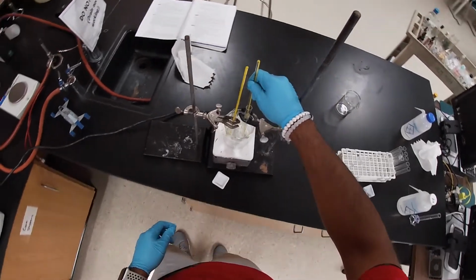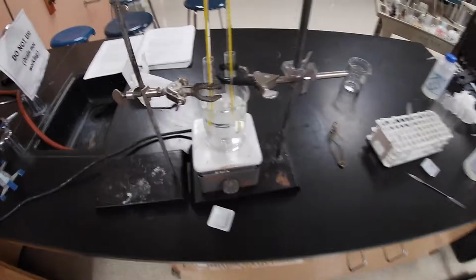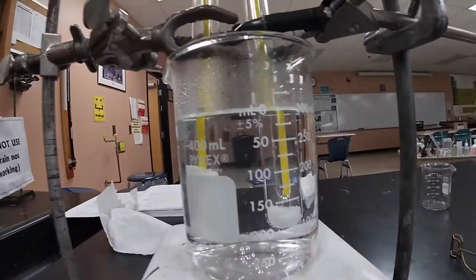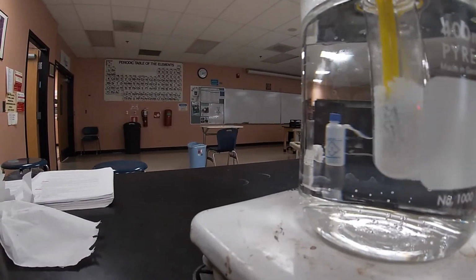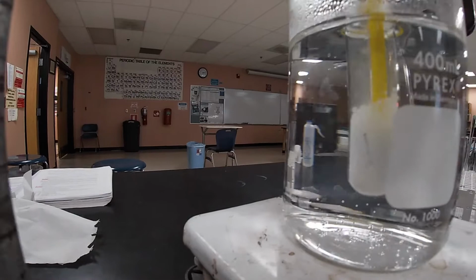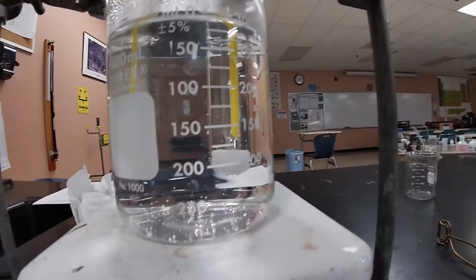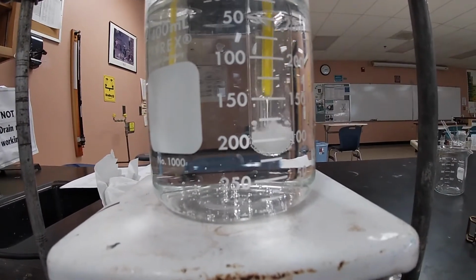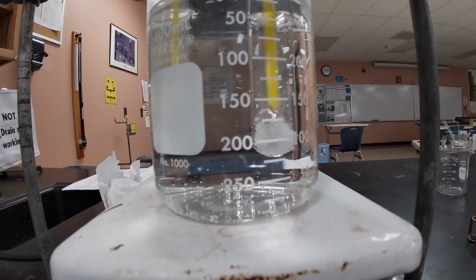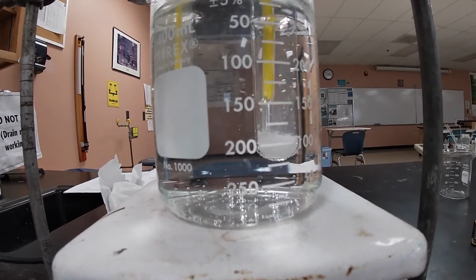Okay, I'm almost done with the 4-gram one, and I'll go ahead and give you a different perspective. And as you can see now, we got the little label there of the Pyrex. So as you can see, I'm gonna heat up, and hopefully that one can get down. This one's almost done. And then once it's done, I'll go ahead and remove it from the heat, and then I'll allow it to cool, and then let it sit down so it can crystallize. So hopefully this one I can get it done quicker.